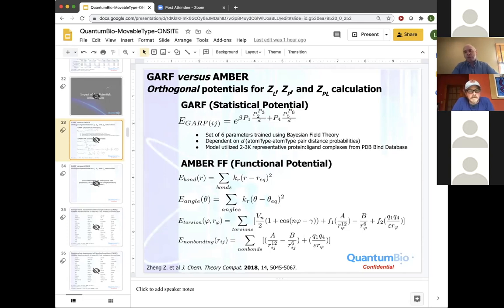Or you'd output from Glide, and mol2 just happens to be a nice format because it had a lot of XYZ coordinates, and it was clear that generally you're talking about a single pose in that case, because again, if it's a ligand within the active site, you're just defining a single pose. But if it's an SDF, that's fine. It just makes sure in that case it's the single placed pose within the active site. But so yeah, that's fine. I think you'd even provide a PDB file that has the ligand if you wanted to. Doesn't really matter to us.